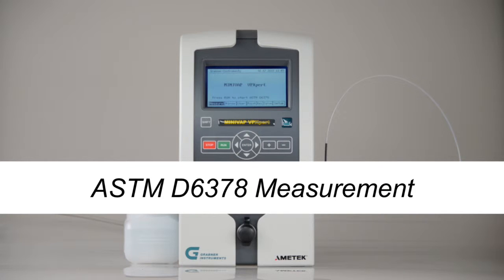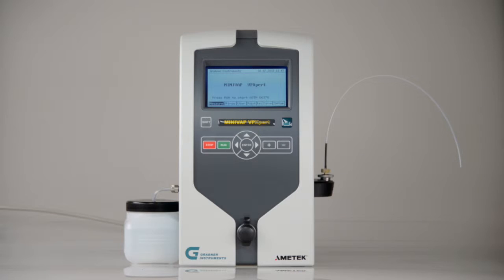ASTM D6378 measurement. ASTM D6378 measures the absolute vapor pressure. This method is also used to check instrument calibration. Cooling and air saturation is not required. On a new analyzer, this is the default method.